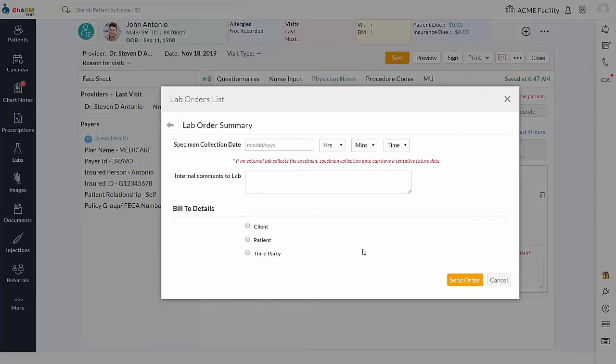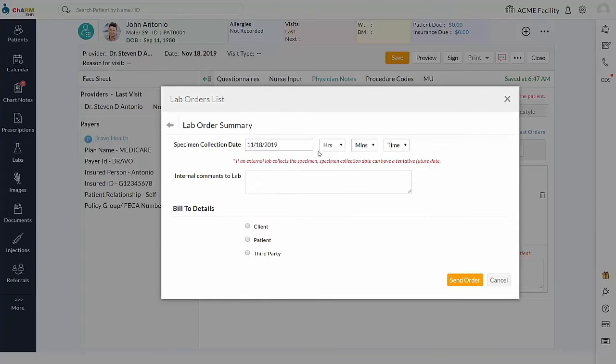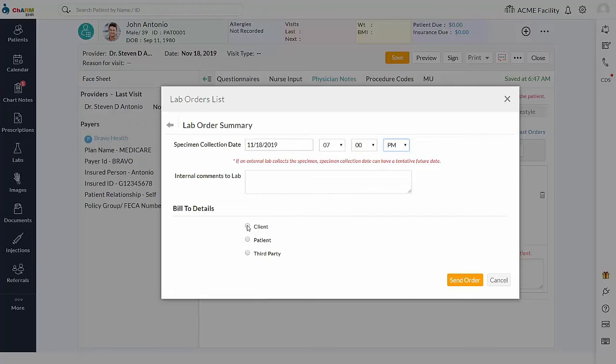If you have in-house laboratory and collecting specimen for this lab order in in-house labs, please fill the specimen collection date and time. Bill Type. Lab can be billed in three ways such as client, patient, and third party. You can select the option based on the individual who pays the lab fee.